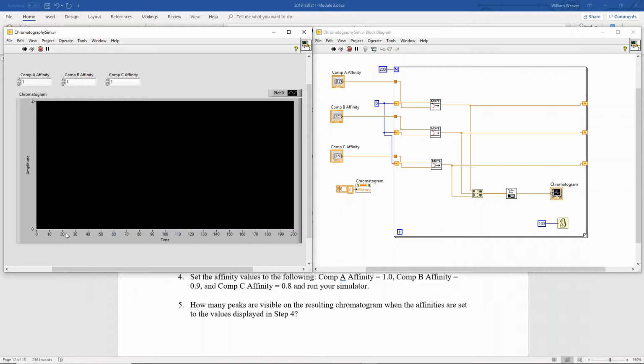So if we go ahead and press this button, down here you're seeing nothing happening at the detector. We're letting the chromatogram run. This is 100 down here. And then at 100, all of a sudden we see a peak. So this is called a peak. It sort of looks like a little tiny mountain, and nothing happens until 200, and this thing will stop. So it's all finished. It's fantastic. So we only get one peak.